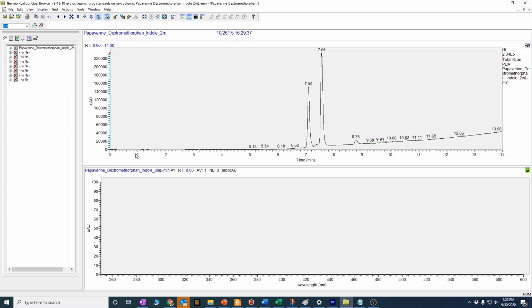It's not great for identification. It's, I believe, category B, maybe a category C. I'll have to check on that. But it does give you some information about identity, where the peak is on the x-axis. Now, the peaks in UV-Vis are very broad, so that doesn't give you much information.